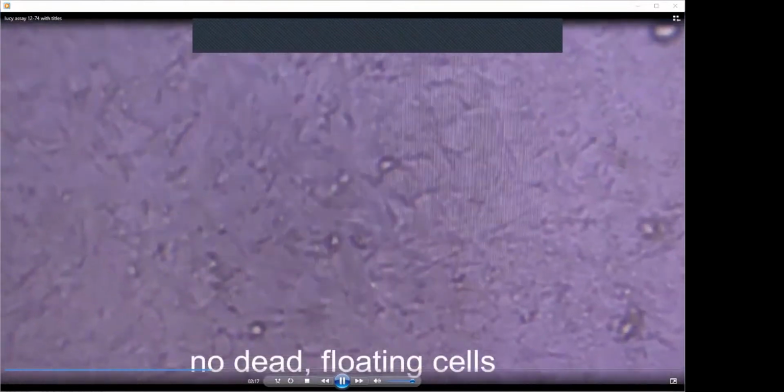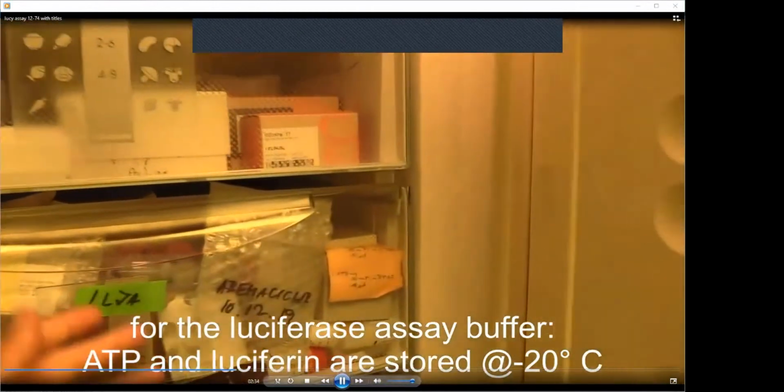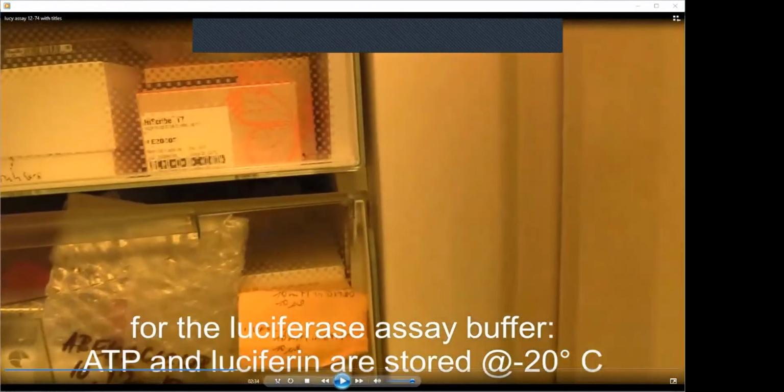These transfected cells, once again, you see very few of these rounded up cells. The whole culture is confluent. There are cells everywhere, and you see these cell-cell contacts. There are no dead cells. With beta-catenin transfected cells, usually there is increased proliferation, so the culture should be more dense.